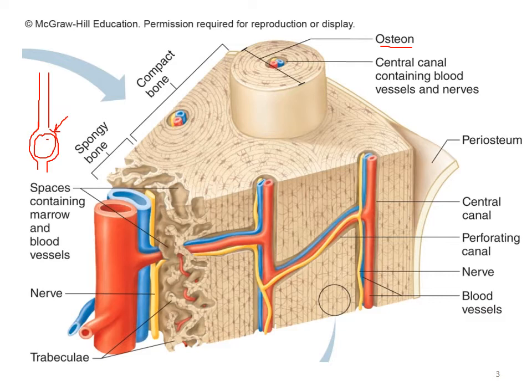So it's hard to describe, and sometimes it's hard to visualize the fact that they're two different things. The cell itself is the osteocyte, so we'll pretend like what I just drew here is an osteocyte. But the cavity that it is in is the lacuna.